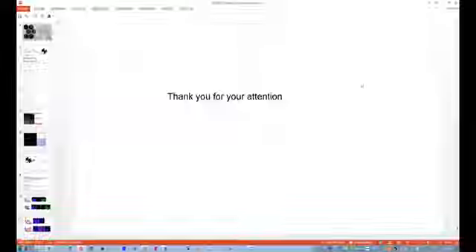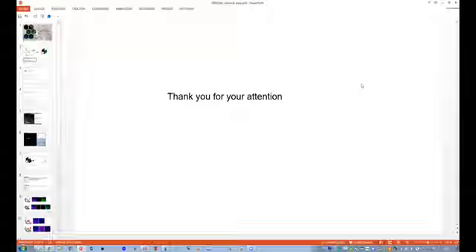Yeah. I don't know if you, maybe François, sorry. Yes. It was very detailed, but when you get to the end, you get the image with your components. It was not clear to me when you show the components. Of course, you have a fluorescence spectrum for each component.